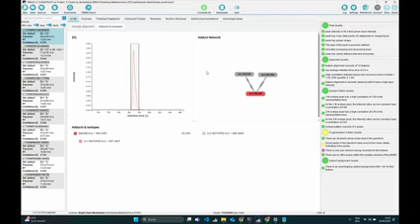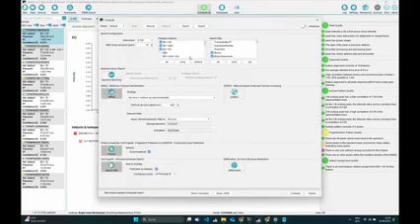Yeah. So SIRIUS doesn't care about what the source of the molecule is. It's just by the selection of the database where you restrict the search space. In our biodatabase, it's not really a biodatabase, I have to be careful with saying that.